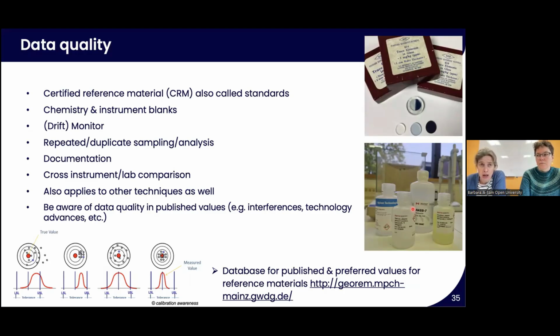Documentation is key. Barbara spoke at the beginning about documentation being incredibly important for the laser ablation in terms of making sure that you're hitting the exact right spots in the minerals, but also in terms of the solution work, making sure that you're documenting what you're doing. Having all of this properly documented is really important when it comes to publishing this data that you're looking at.